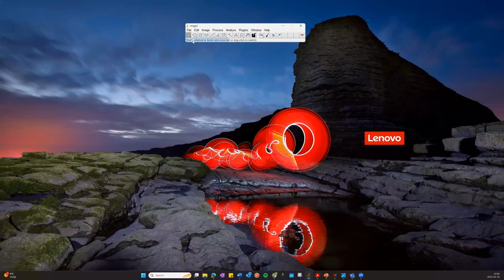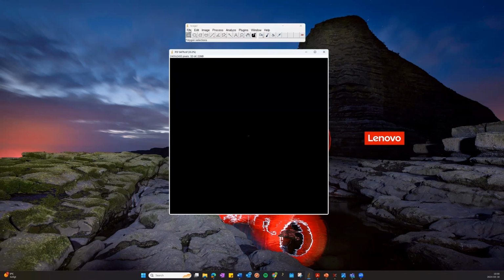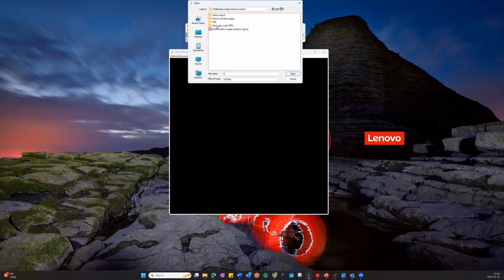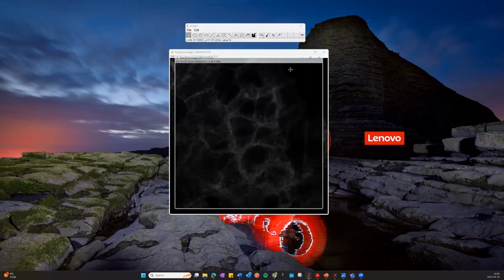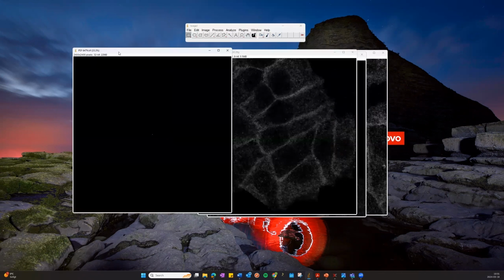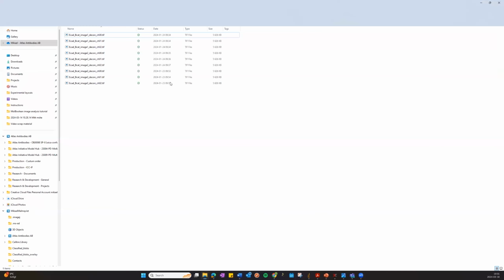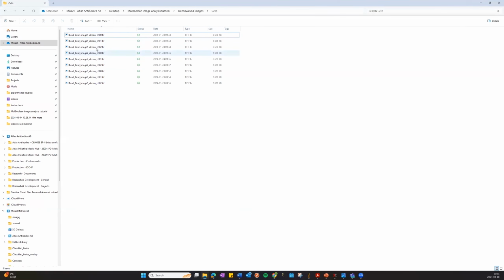You open up the PSF for the 647N instead, and you will then open up your 3 channel 02 images. So I won't go through this also in the interest of time, but it's exactly the same procedure. So in the end, you end up with 3 deconvolved images per channel, 3 different image sets.